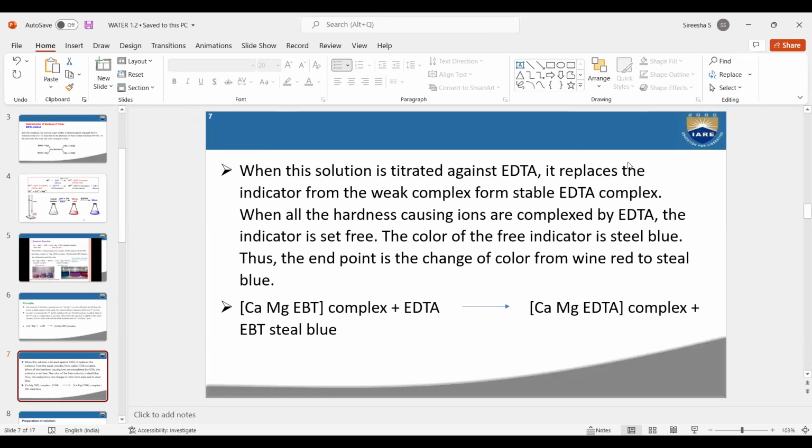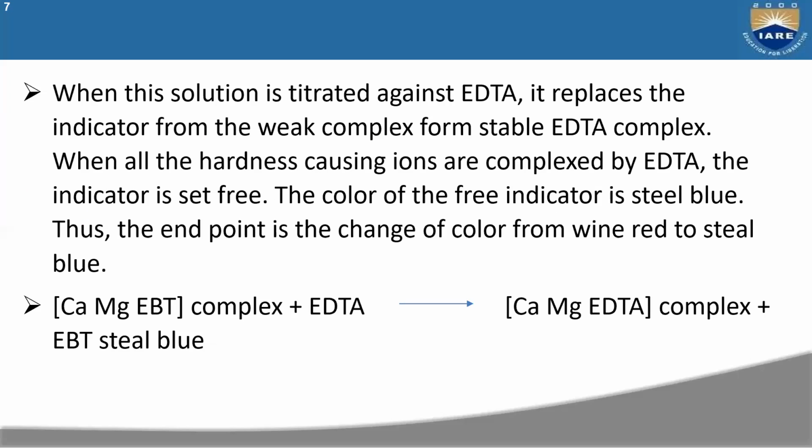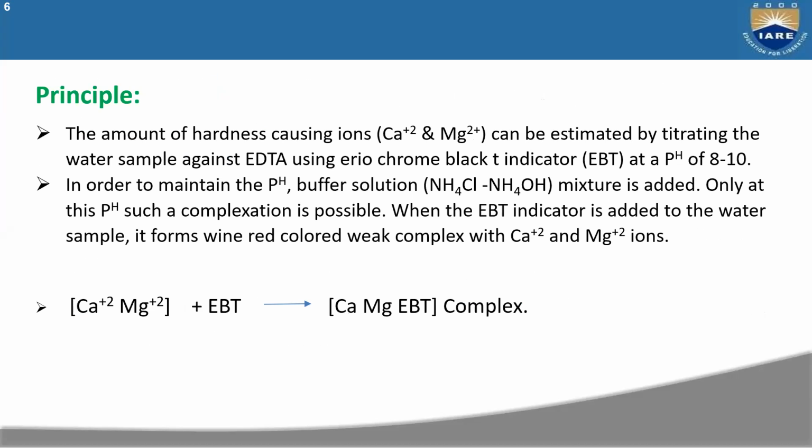What is the full form of EDTA? Ethylene diamino tetraacetic acid. Okay. So, estimation of hardness. See the principle: the amount of hardness causing ions, calcium and magnesium, can be estimated by titrating the water sample against EDTA.